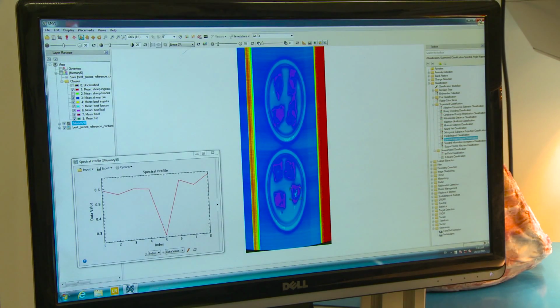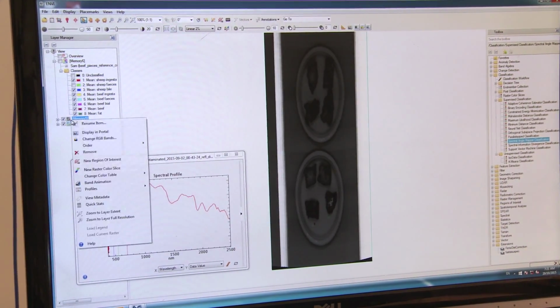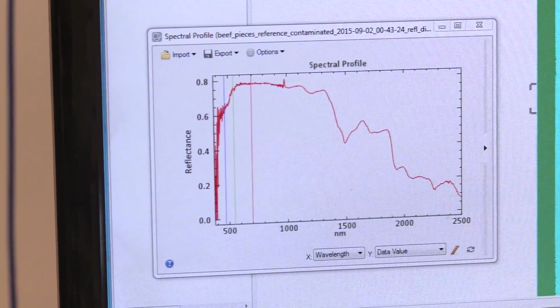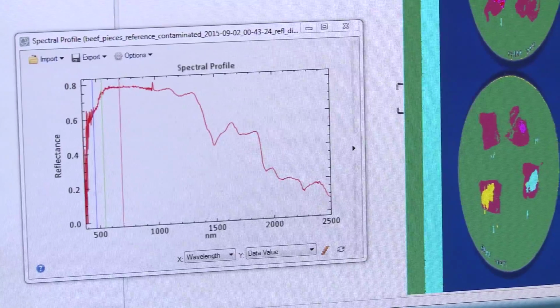Hyperspectral imaging is the process of capturing an image over multiple bands of light. As opposed to your standard colour camera or grayscale camera, where you capture 1 or 3 bands of colour, this camera is capable of capturing over 600 bands of colour right across the electromagnetic spectrum at a very high resolution. Hyperspectral processing is when we process that data and work out what some of the chemical signatures in the data are and grade the image.